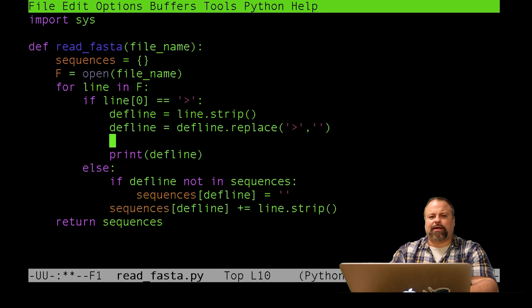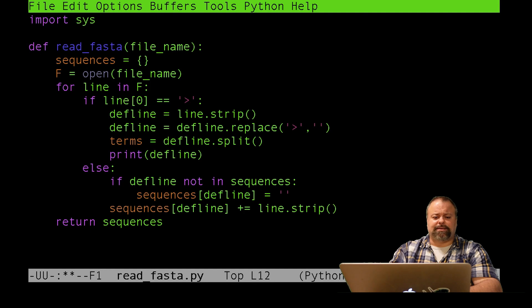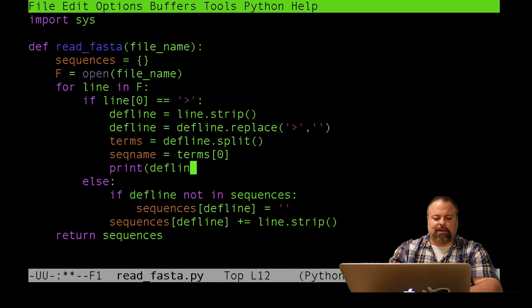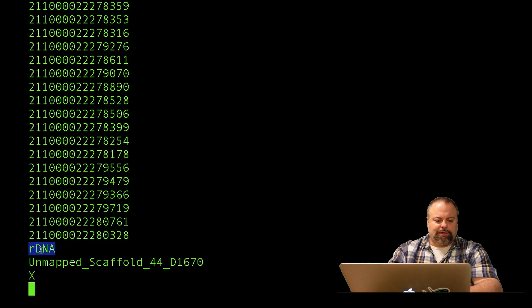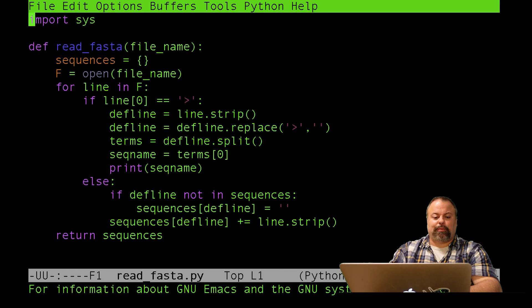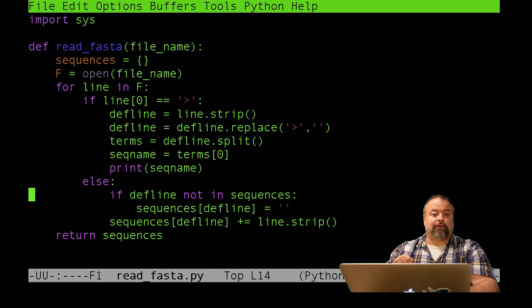What I'm going to do is split these deflines on spaces and save the first term — I'll call that the seek name. So I'll do: terms equals defline.split(), and the default behavior for split is to split on spaces. Then seek name equals terms of zero. If I print out the seek name and run that, you can see these are the seek names identified — some unmapped smaller broken contigs — but we hit chromosome X again and it just gets stuck.